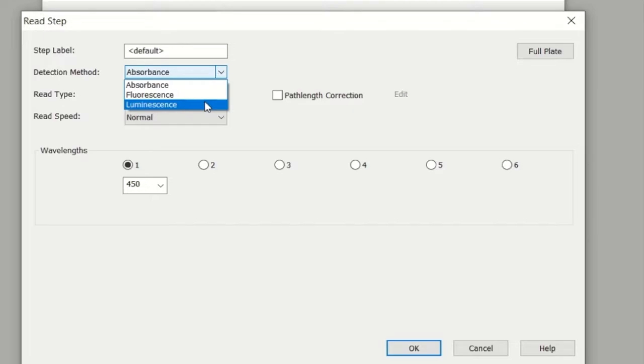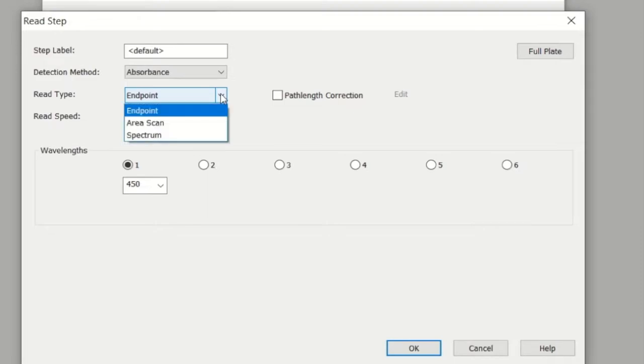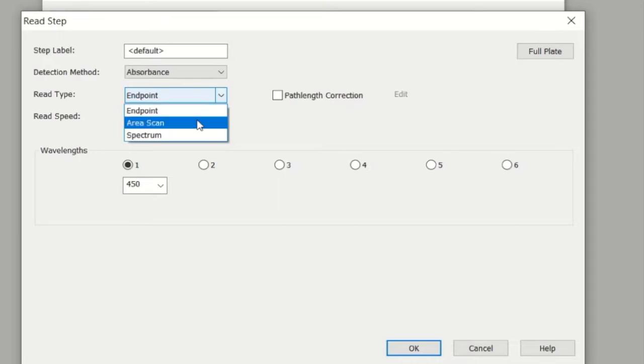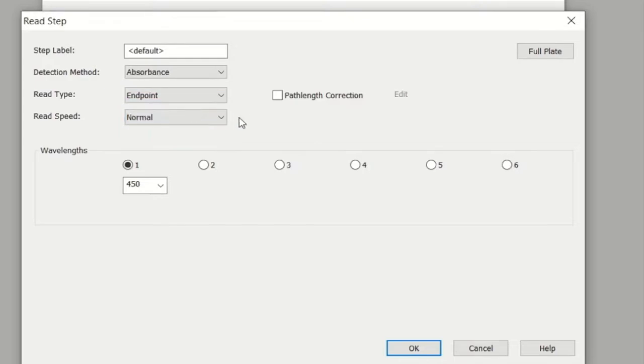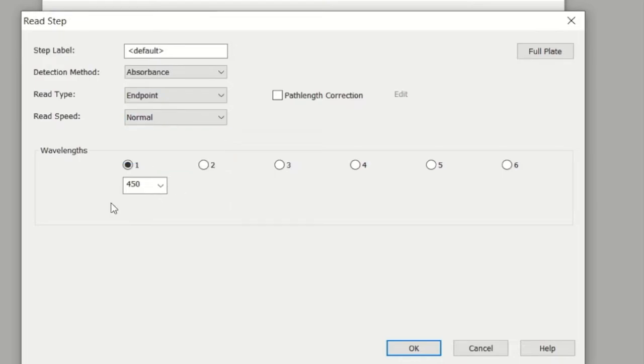For this example, we'll select absorbance. We're just looking at light absorbance as the final readout. You need to select the read type. Is it just one endpoint read, or do you want it to do an area scan or a spectrum? For this example, I'm selecting endpoint because the assay, the ELISA, was performed and we just want an endpoint. Gen5 asks you the kind of read speed you want: normal, rapid, or sweep. I'm sticking to normal.